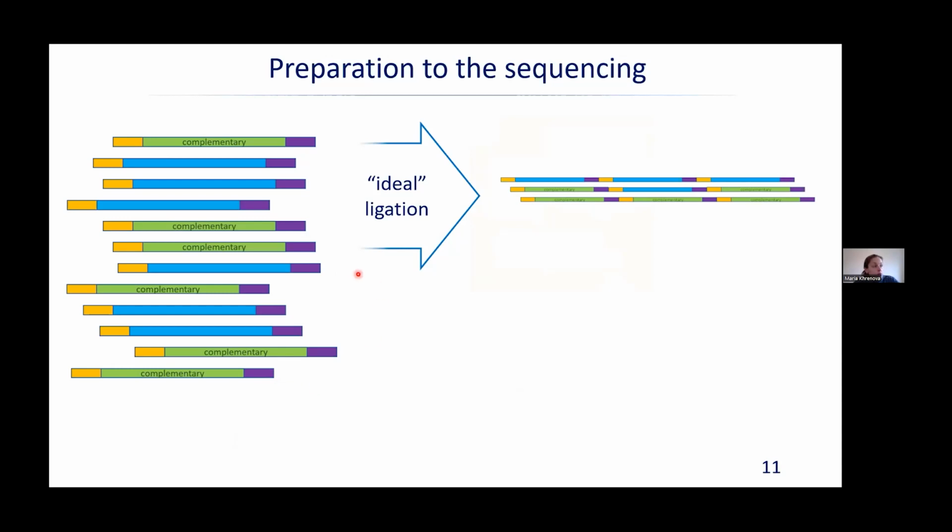In an ideal world, we wanted to get a combination of aptamers obtained in forward direction, so it's like multiplication of an aptamer, or multiplication of the complementary aptamer, or a combination.